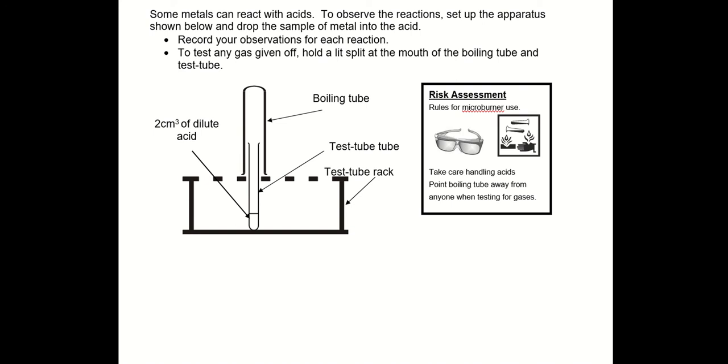Well, magnesium plus hydrogen sulfate should give us magnesium sulfate plus hydrogen. It's stealing away the hydrogen from the hydrogen sulfate. And so what we should be able to see is the gas hydrogen given off. Now, hydrogen is an explosive gas. This is one that you usually enjoy doing in the laboratory.